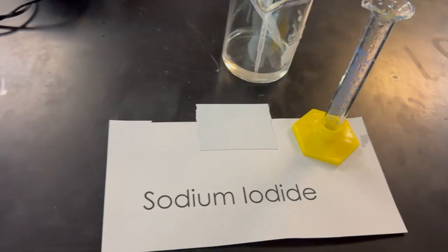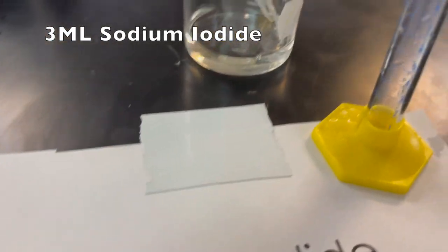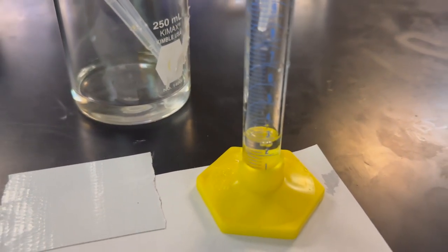Okay, next is your double replacement reaction. So 3 milliliters of sodium iodide. And so you're going to write that out. So here we have 3 milliliters.